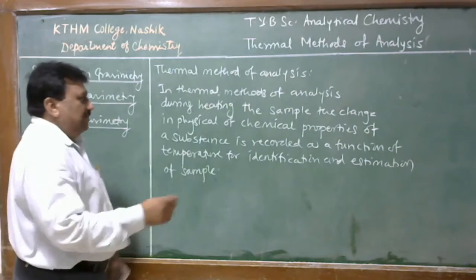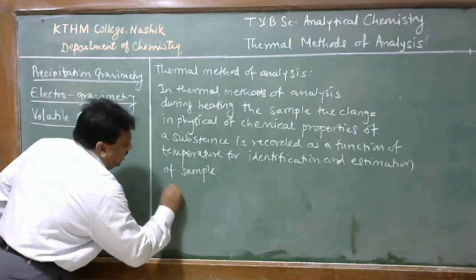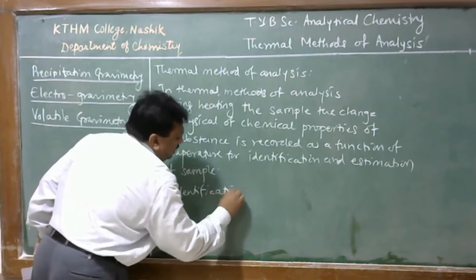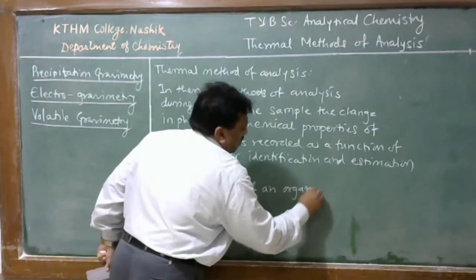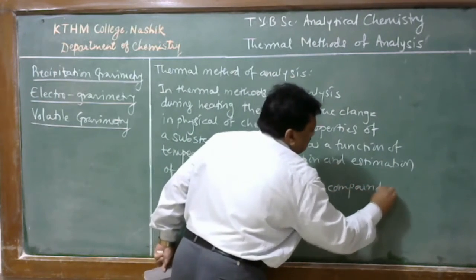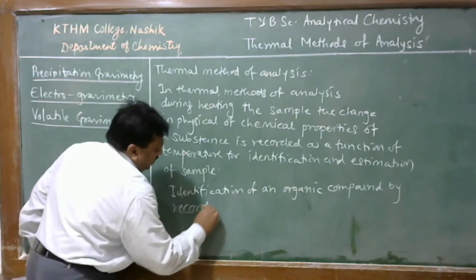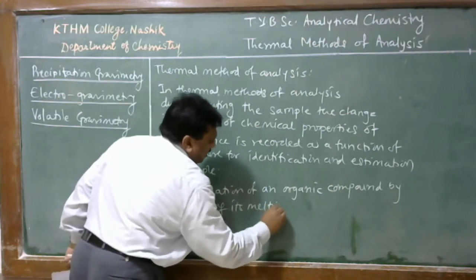The best example of qualitative analysis is the identification of an organic compound by recording its melting point or boiling point.